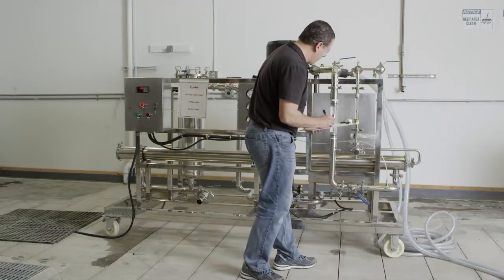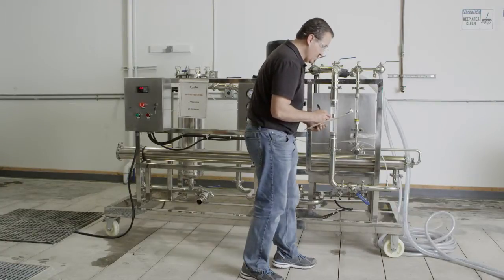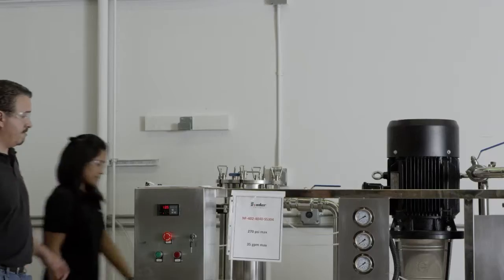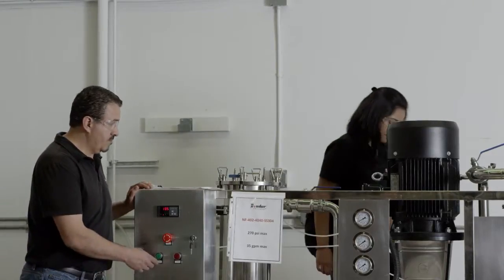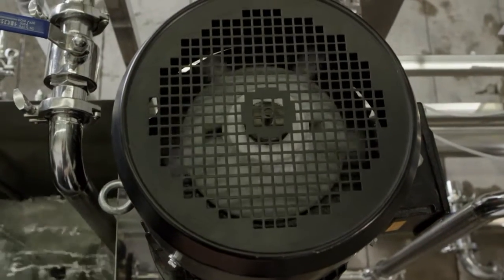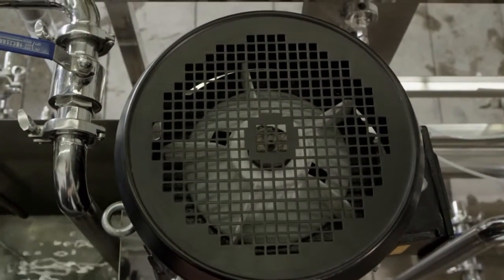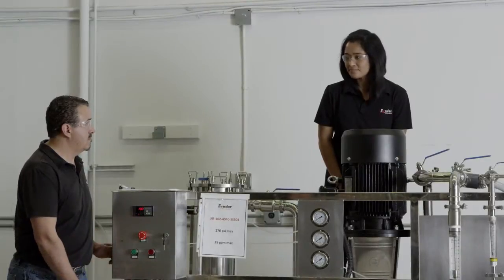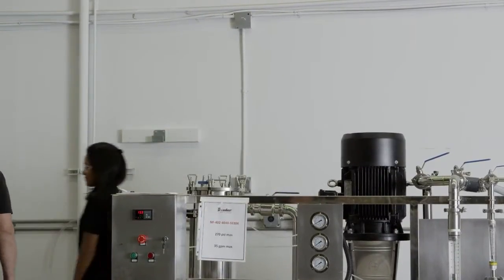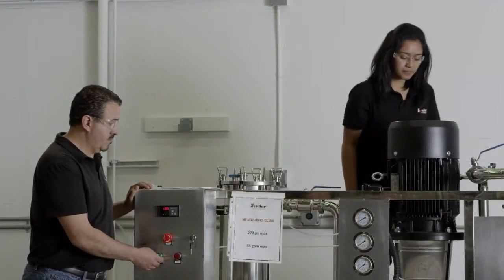Before you begin, make sure that the system has had the proper electrical installation performed by a certified electrician. To check the pump rotation, turn the pump motor on for just a second and then quickly turn it off. Observe the rotation of the pump impeller, and if it is spinning backwards, have your certified electrician switch the wires to the pump motor. Repeat and confirm that the pump is rotating in the proper direction.